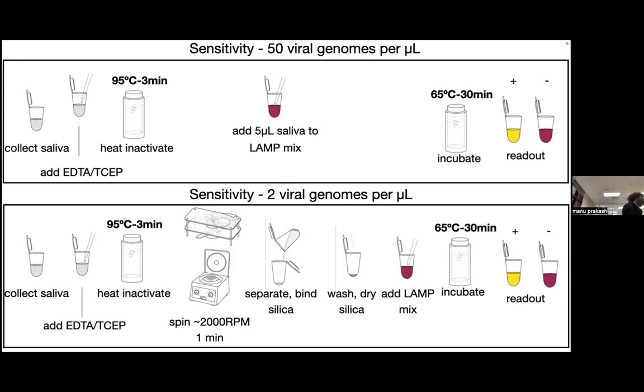So when the user is using it, if the thing turns green, that means that's the right pace to pump energy at. And then, of course, you'll see a really beautiful component here. It's the ratchet that makes only unidirectional rotations, but it's actually a centrifugal ratchet, which, if you watch it carefully, has two other arms that themselves fling out when it's rotating. So there's a degree of freedom. I'm just going to first show it on video.